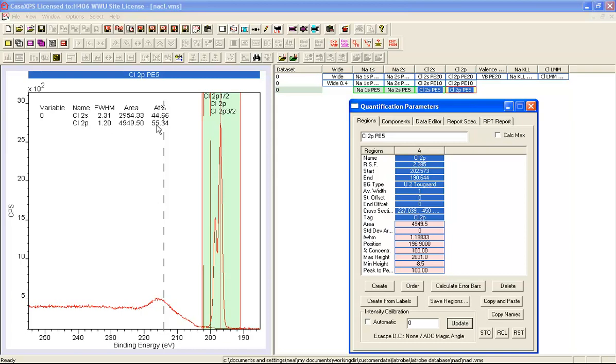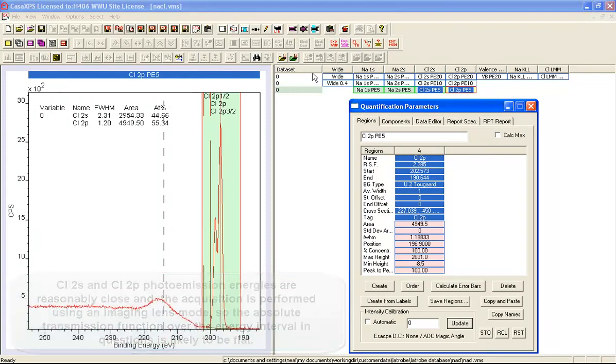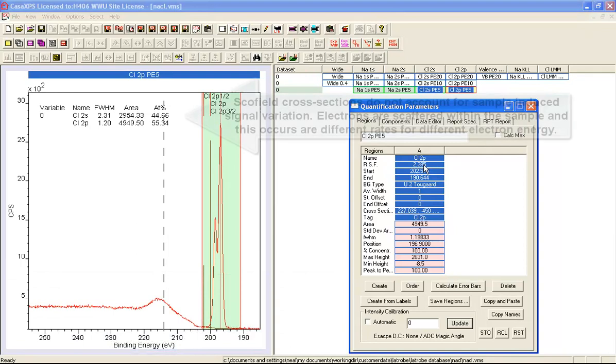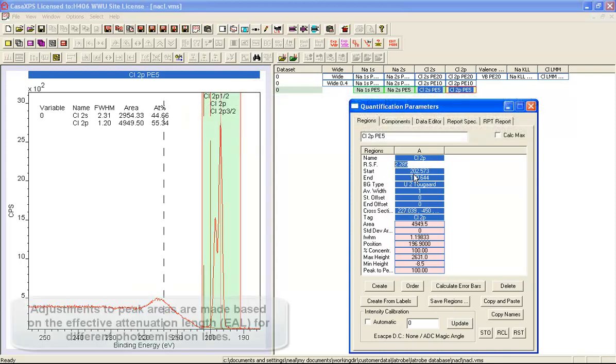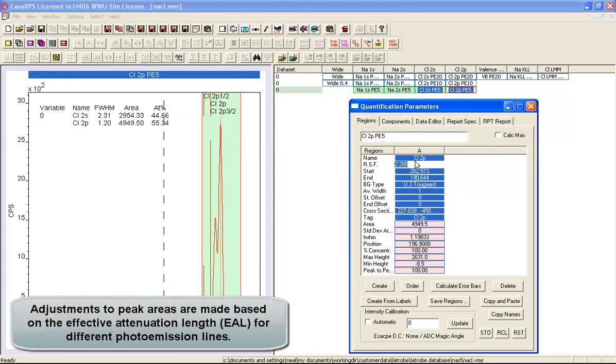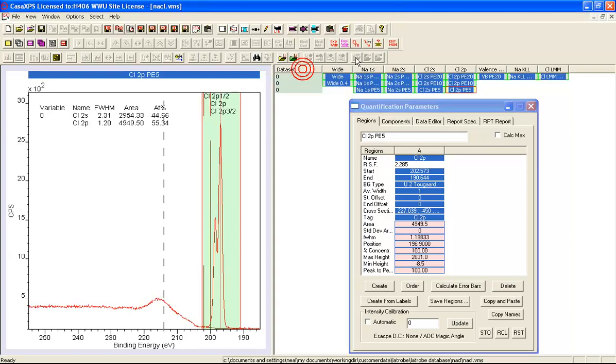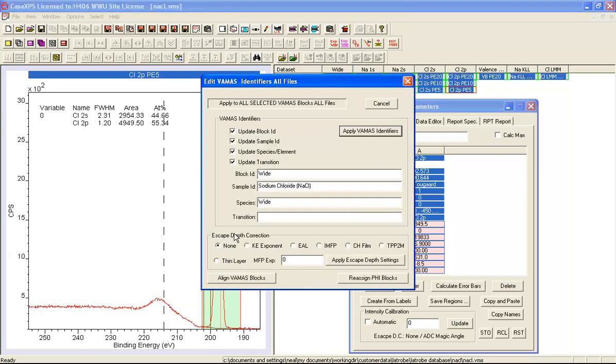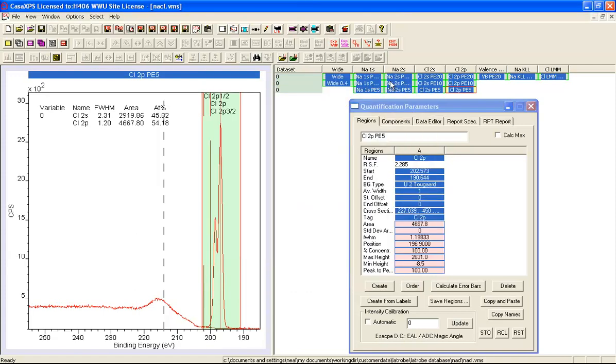It's still not 50-50 so what other corrections can be made? The Schofield cross sections are transition properties that have been calculated so they really have no information about the properties of the sample or the instruments. The sample in particular will have different escape depths for different kinetic energies. Although these peaks are quite close, the 2S and the 2P, there may be a difference here in the escape depth correction that's required. What we'll now do is apply an escape depth based on an effective attenuation length. We're getting closer. We're now 54 to 46 so it was a small correction but it didn't take us to the 50-50 that we desire.